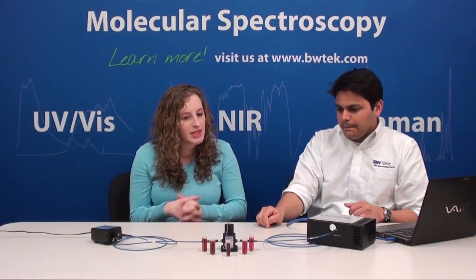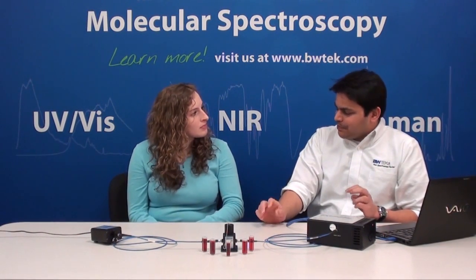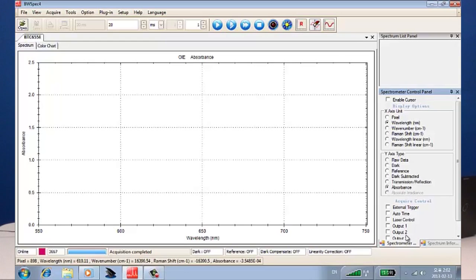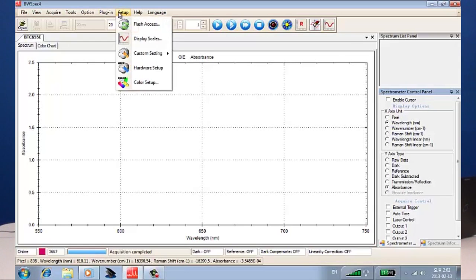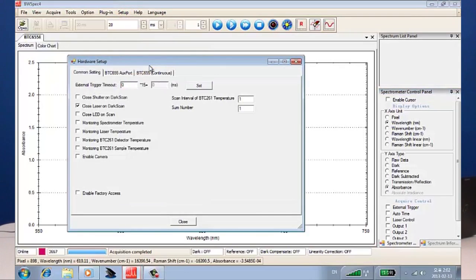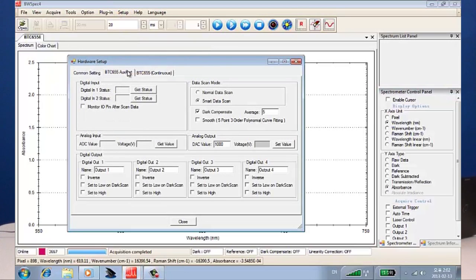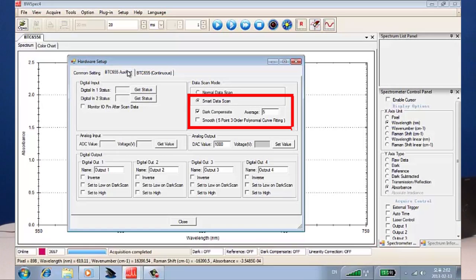So, to start off, do we take a dark scan as we've done in the other experiments? Usually you would, but the cool thing about the Exemplar technology is that we now have the ability to do automatic dark compensation. If you go to the hardware setup in the software and click on the spectrometer that's being detected, it opens up a window where I can enable the smart scan mode and then check the automatic dark compensation button.